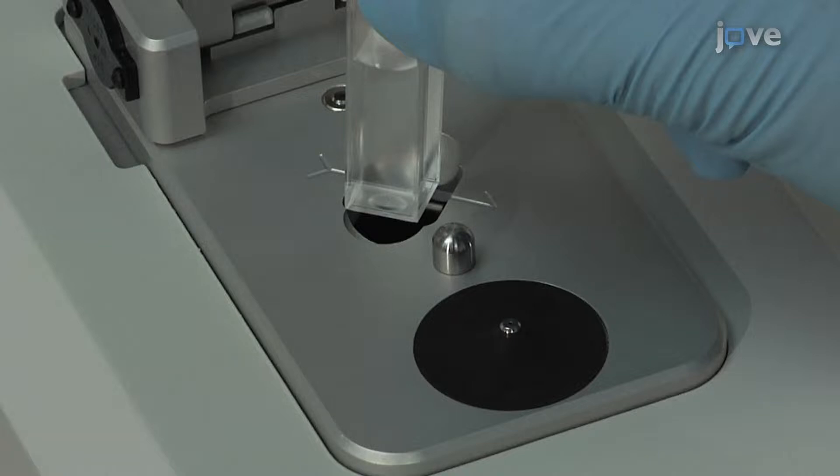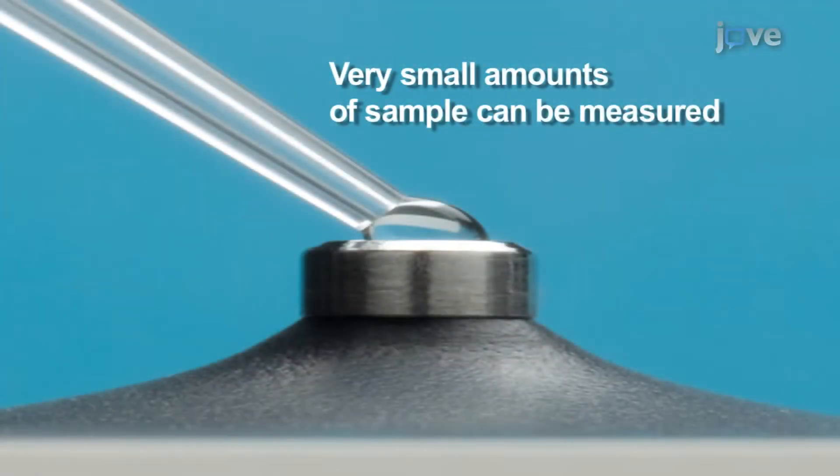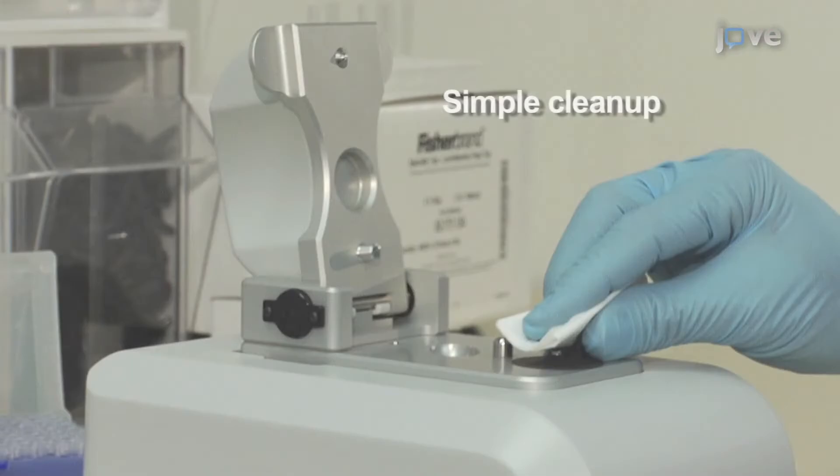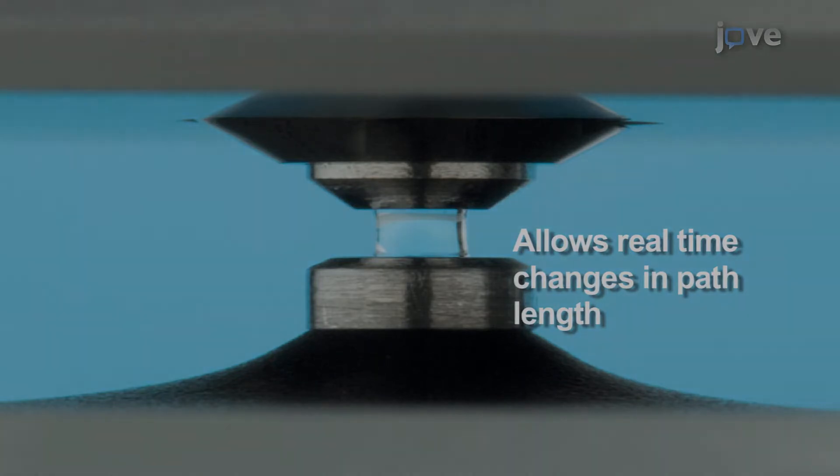Removing traditional containment devices such as cuvettes from the system has several advantages. Very small amounts of sample are needed for measurement, one to two microliters. Cleanup simply requires wiping the optical surfaces with a laboratory wipe, and the path length automatically changes in real-time during the measurement.